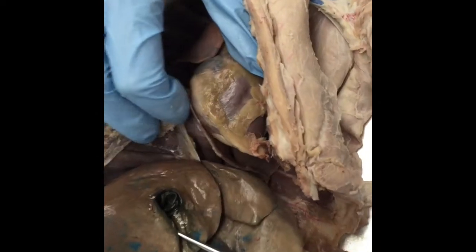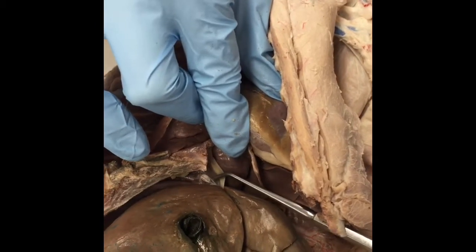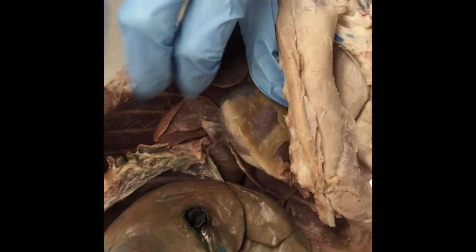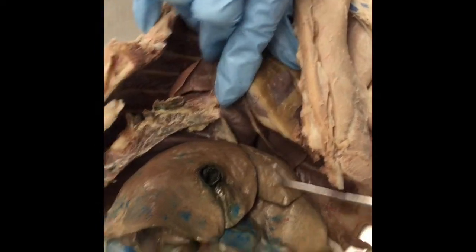And then if we bring the diaphragm up, we have the round ligament right here. The falciform. Sorry, the falciform. Should we redo that?